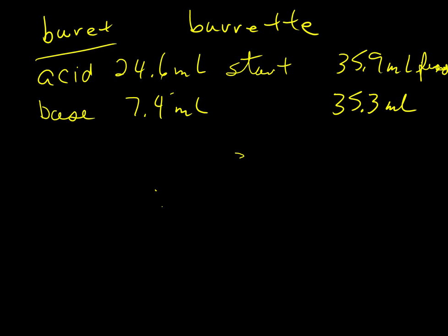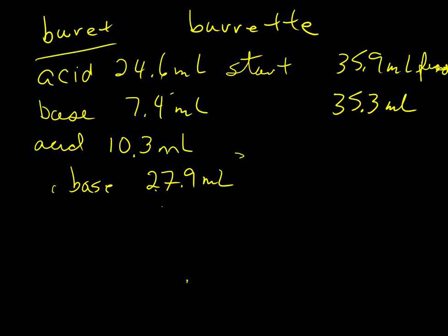So that means that I used my acid, I used 24.6 to 35.9. That is 10.3 of acid. And base I used 7.4 from 35.3 is 7 would be 28. So 27.9. 27.9 milliliters of base. And I know the base was 1.0 molar.